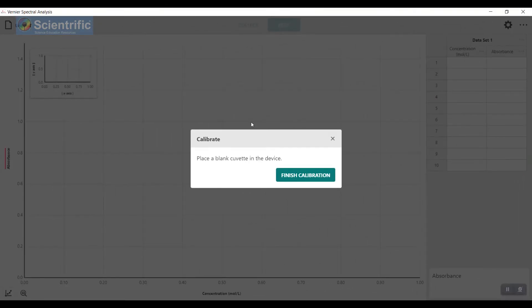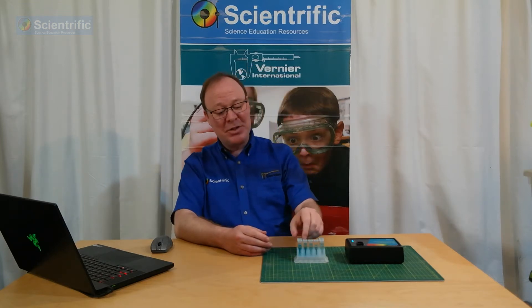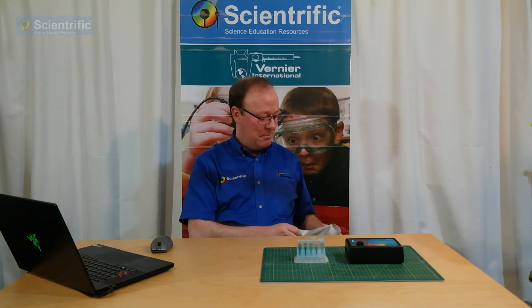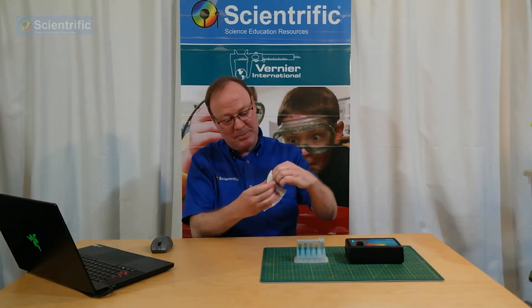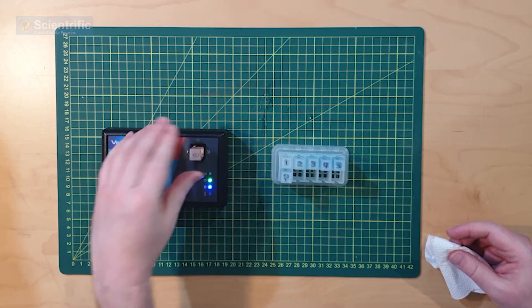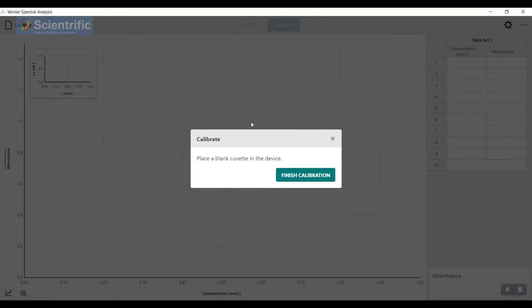We've gotten to the point where the lamp is warmed up. All we need to do now is finish the calibration. For today's Beer's Law, my blank is just going to be plain water. First thing I'm going to do is take a little bit of paper towel and give the cuvette a quick wipe on the edges. I want to make sure it's nice, clean, and clear to get a good reading. I'm going to pop it in, making sure that the clear side lines up with the arrow. Then on the screen, I'm going to go to Finish Calibration.